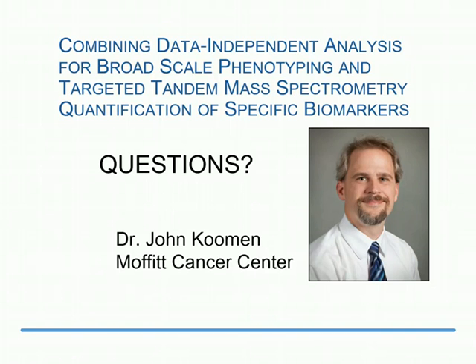All right, next up is, what mass spec specifications should be met to be able to do DIA? In that case, you just have to decide the content that you want. In general, we feel you have to have really high resolution, accurate mass measurement of the intact peptides. That helps you map them across the different experiments. So that's either a time of flight type of instrument or an orbital ion trap type of instrument. We've done a few of these experiments on an older linear ion trap instrument, and then you have to rely more on high quality MS-MS matches, so your content drops significantly. You're not able to take the strength of identifications across the whole data set. You'd have to rely on having tandem mass spectra in every single example.